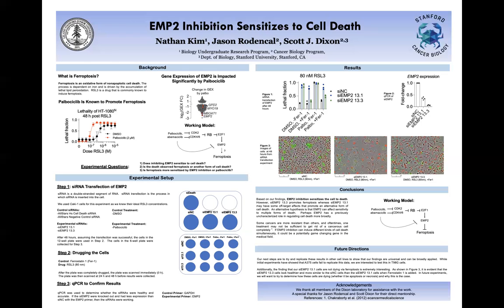After doing this and scanning every 24 hours up to 48 hours, so 3 total times, we did the third step, which is a qPCR to confirm the results. What the qPCR told us was whether or not the siRNA had successfully gotten into the cells. It was more of a check the results sort of experiment, just to confirm that everything had gone smoothly.